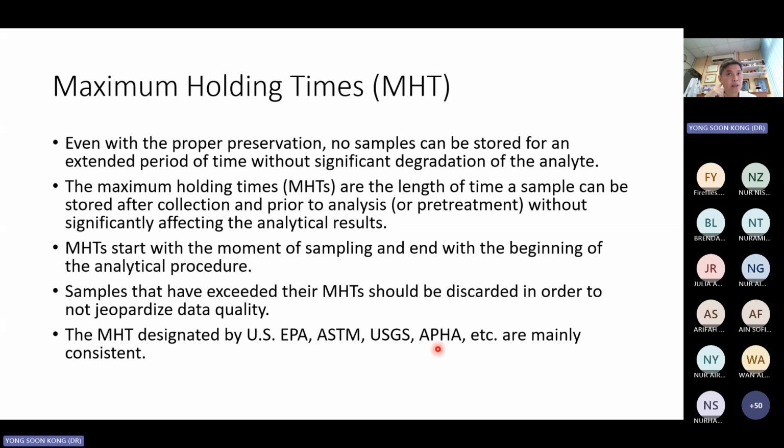In terms of sampling, they are the ones doing it. So you have to remember, whatever we're going to do in terms of river water sampling, LUAS has to be contacted and asked. Because in the Malaysian context, when we want to monitor a river, LUAS collects the sample, DOE analyzes it, or if DOE cannot analyze it, they send it to the Department of Chemistry.